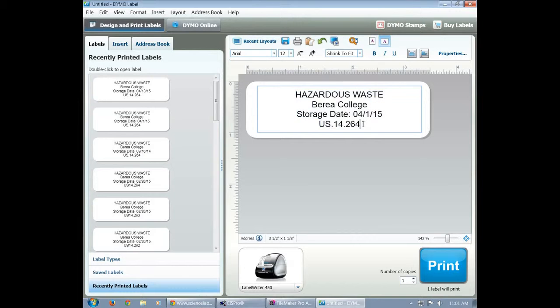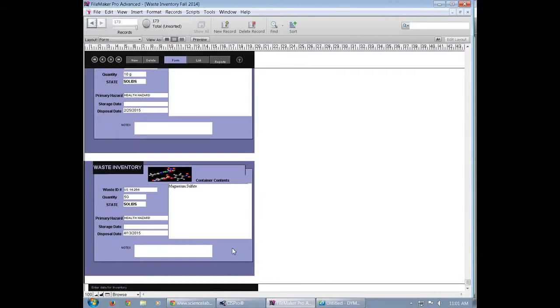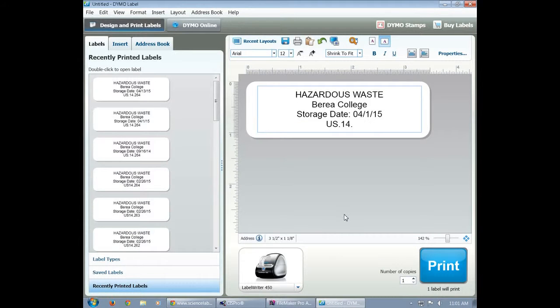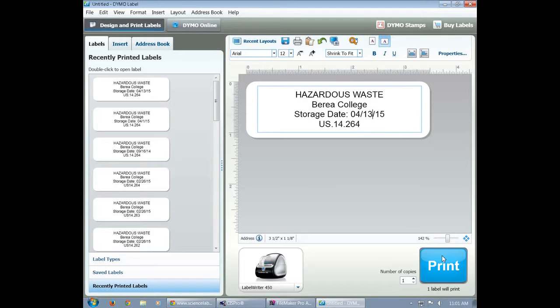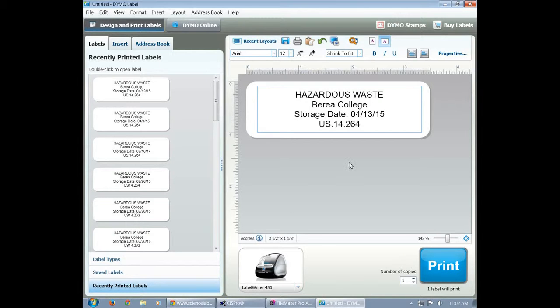So in the sticker template, you'll delete the previous information and you'll put the new US waste ID number. In this case, it is 14264. Next you have to make sure you modify the storage date. You want the storage date to be the day that you're putting it in storage. So once you get that all filled out, click the print button and it will print a sticker for you.